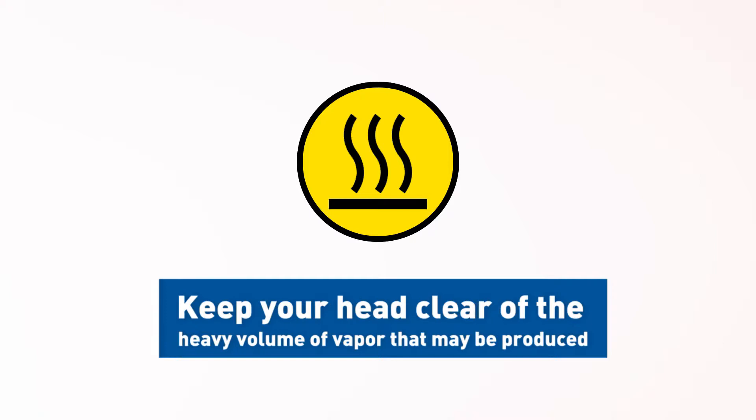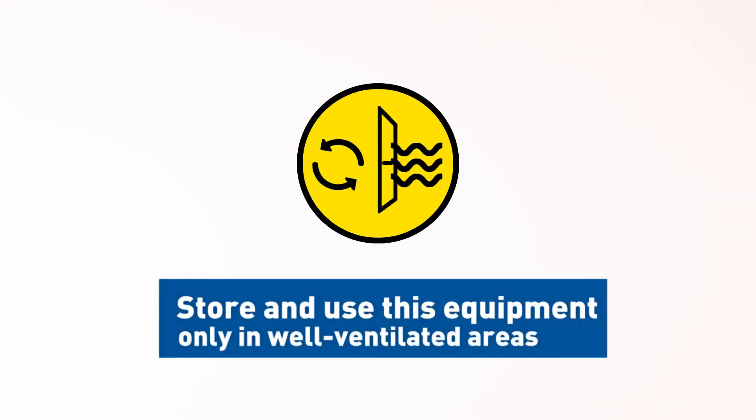Nitrogen gas can cause suffocation without warning. In a confined area, nitrogen gas from this equipment may displace air required for breathing. Store and use this equipment only in well-ventilated areas.